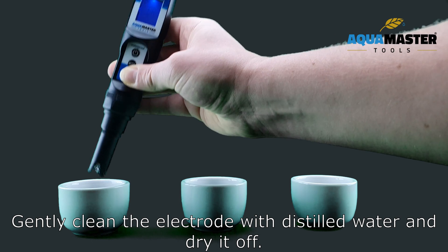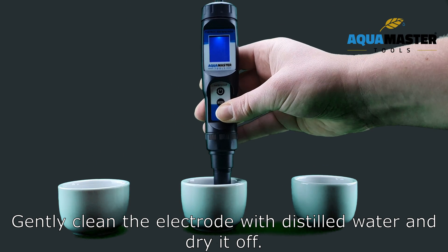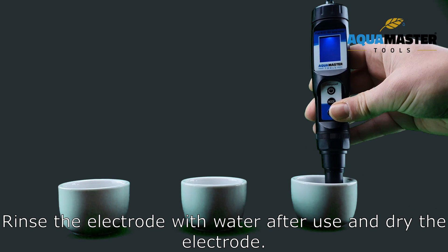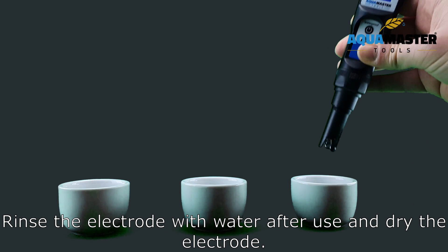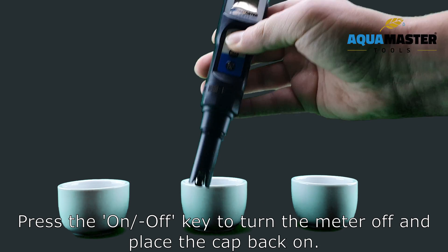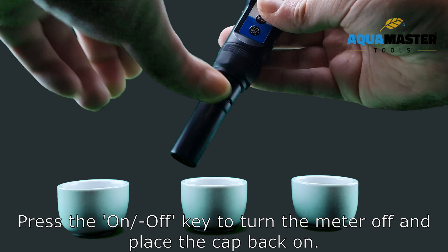Gently clean the electrode with distilled water and dry it off. Rinse the electrode with water after use and dry the electrode. Press the ON-OFF key to turn the meter off and place the cap back on.